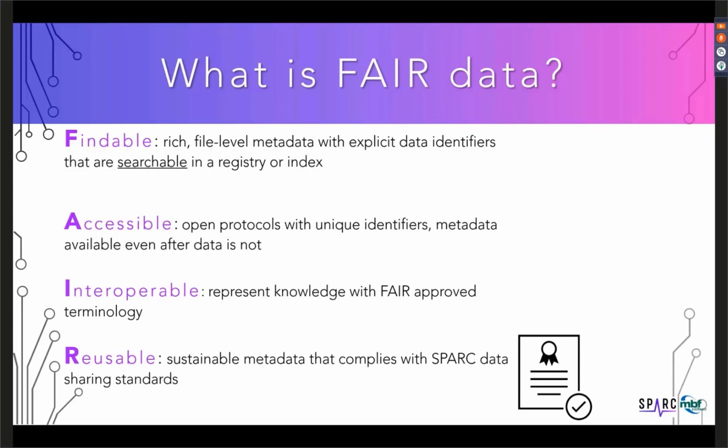I'll have Aiden show you what I mean. She's going to demonstrate how easy it is to capture this FAIR metadata for each segmentation file with just a few clicks in Neurolucida 360. Yes, let's switch over to Neurolucida 360 now.